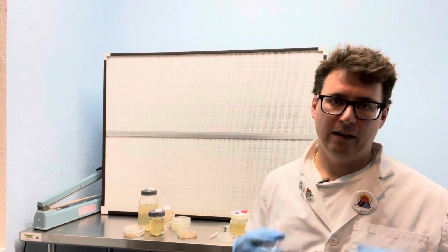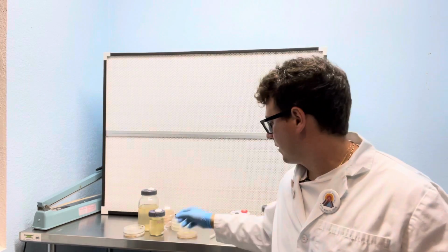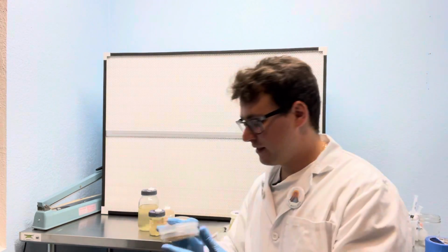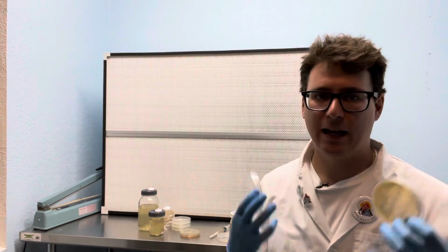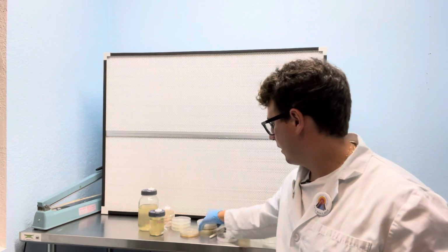The speed at which it grows on agar is relatively fast compared to what it would grow in nature. An oyster mushroom can colonize these plates within a week or two. These plates here are from 2 days ago. The next topic I wanted to get into is the difference in visualization from an agar plate to a liquid culture solution.